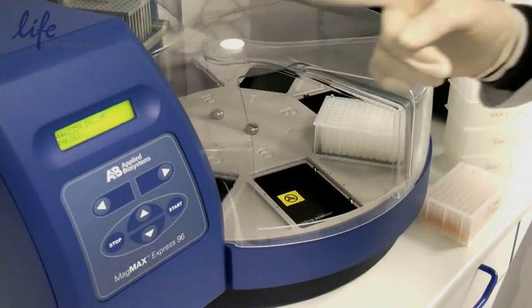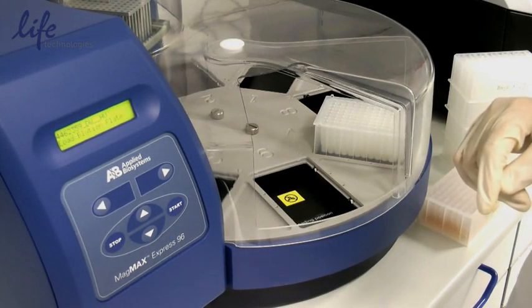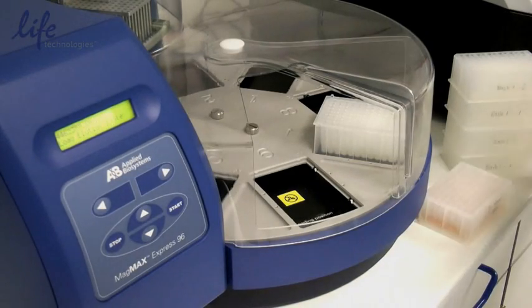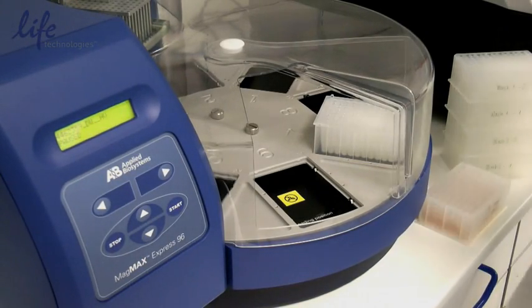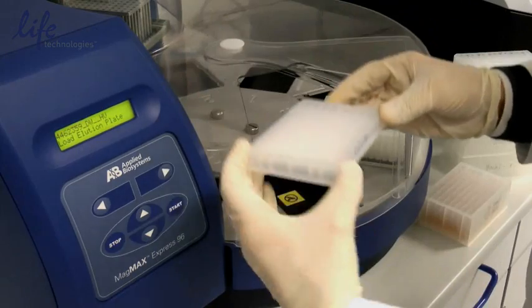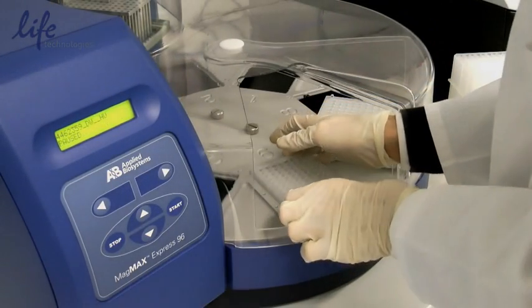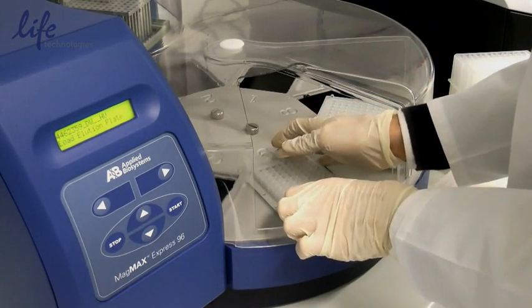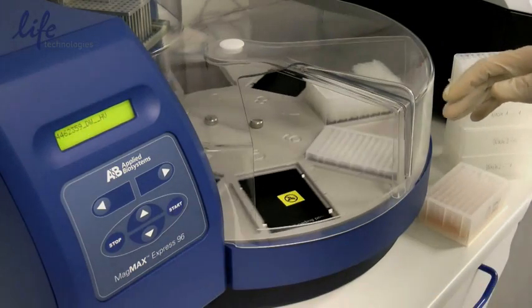Then we press start again and the instrument is going to ask for the next plate, the elution plate. As you can see, it's asking backwards, so this is my elution plate, which is going to be placed in the same position following the same orientation. Then we press start again.